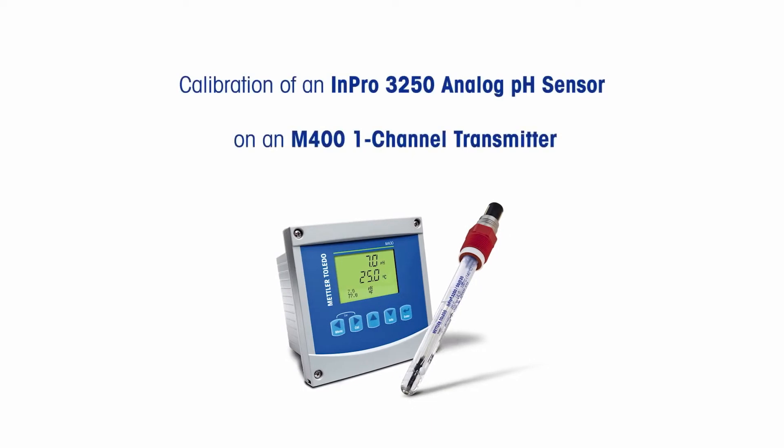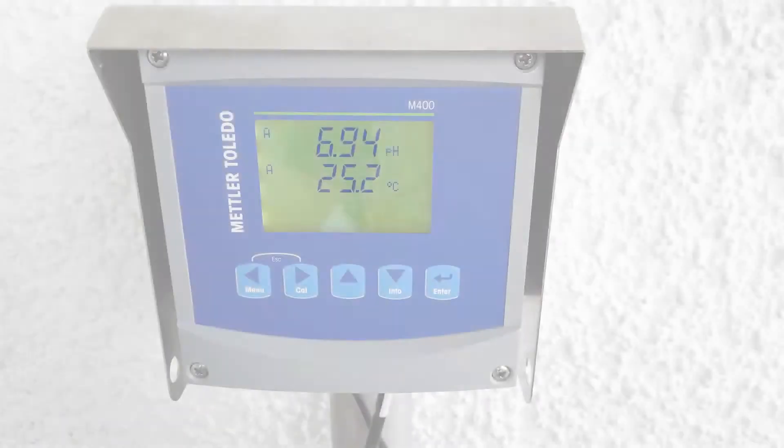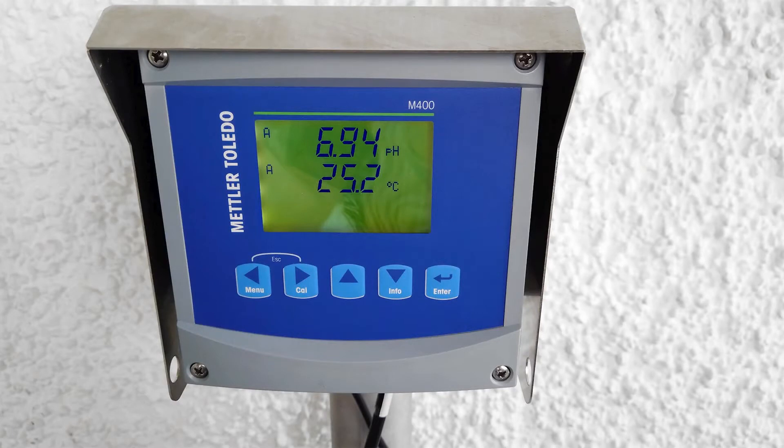Here's how to do a two-point calibration on a Mettler Toledo N-Pro 3250 analog pH sensor using an M400 one-channel transmitter. This M400 model was produced from 2008 to 2018.